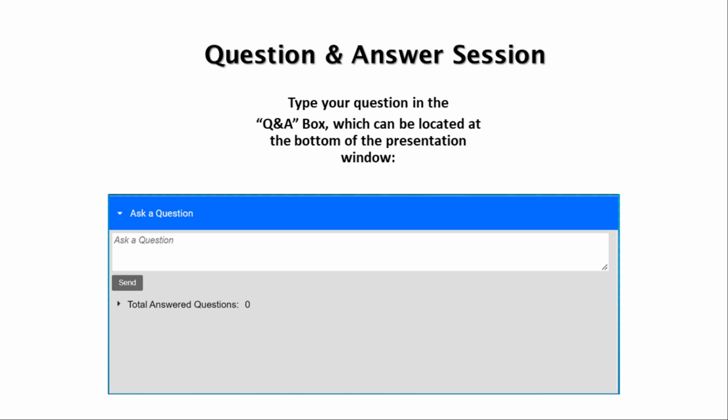Okay. The first question is, your column ID decrease increases your sensitivity. Why not use the 1 millimeter ID or less? Oh, right. So if you have a system that has small enough dispersion, we are able to get the optimum performance from 1 millimeter ID or less, then I would say definitely do that.